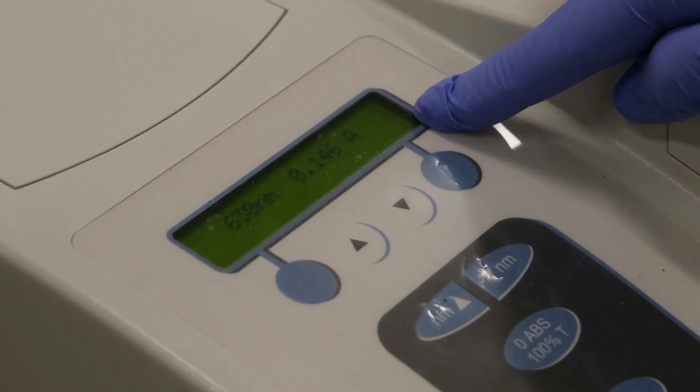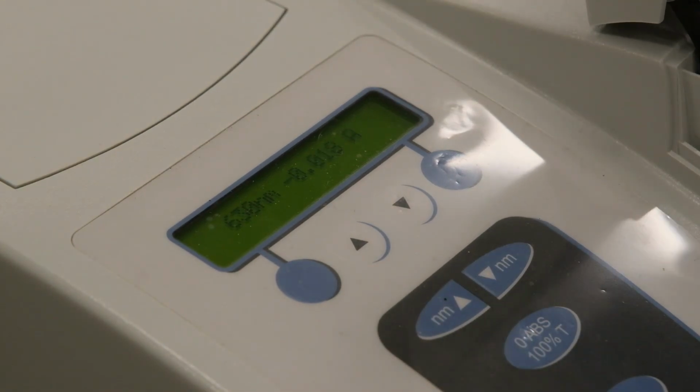We record the absorbance of the most diluted solution.